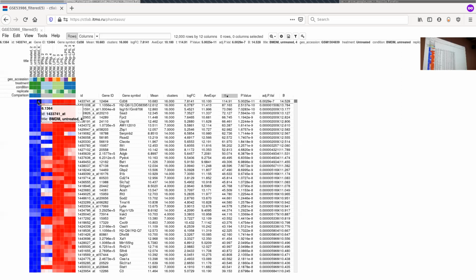Yeah. So indeed, the very straightforward and natural null hypothesis for gene expression data, when we compare two conditions, is that average expression is equal in both, in our case untreated samples and LPS treated samples.